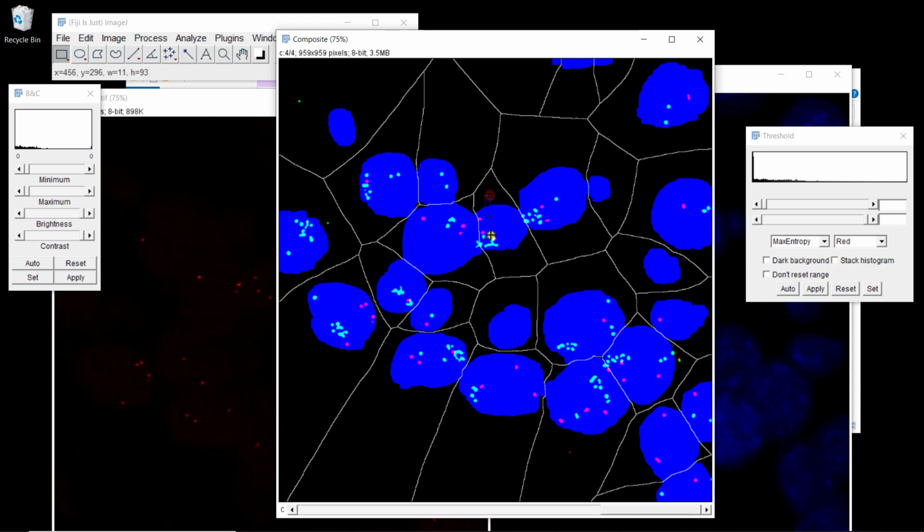So we'll see next week how we can do this kind of quantification. Here, the preliminary analysis, which is to identify all the objects of interest, is done through this series of segmentations. And now when that is done, you can go to the quantification.